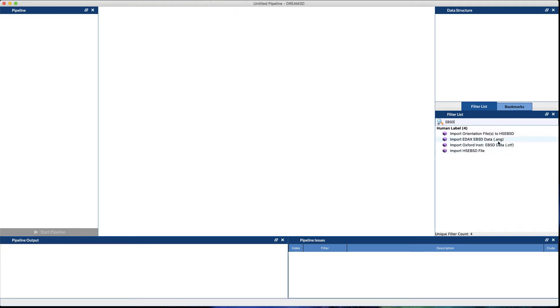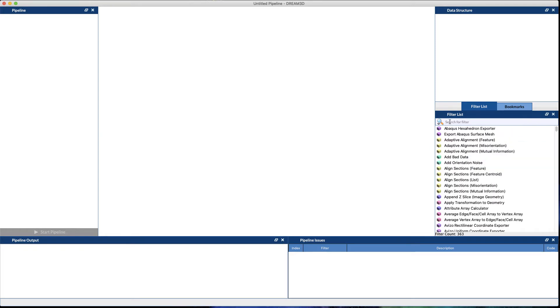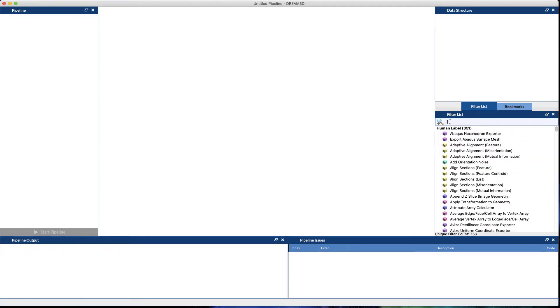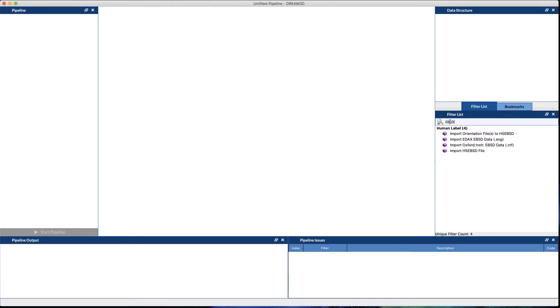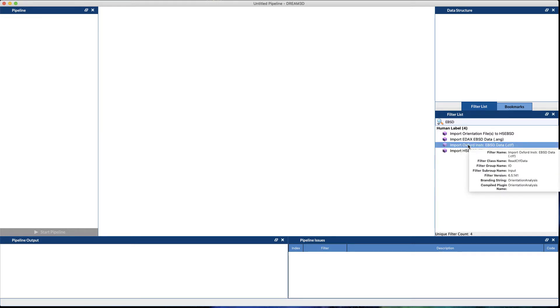We support EDAX ANG, Oxford Instruments CTF, and H5 EBSD files. So what you want to do is first figure out the type of data file that you have. For this example demo, we're going to bring in Oxford Instruments CTF data.